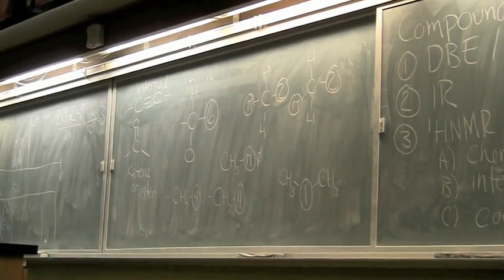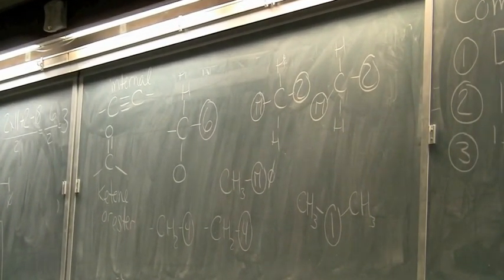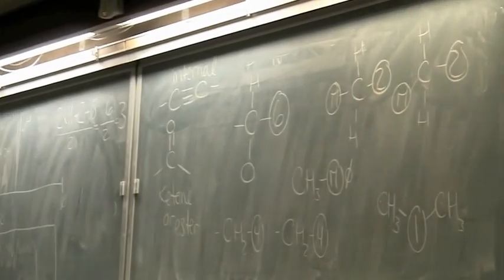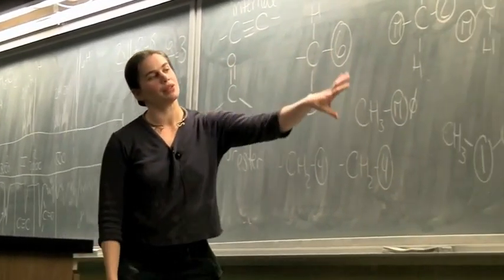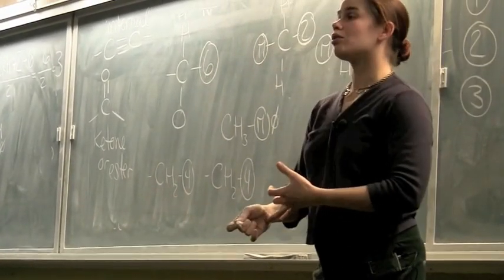Good. If you did have the wrong number of hydrogens, you did the proton wrong. If you have the wrong number of carbons and oxygens and double bond equivalents, you may have missed something in the IR. If you just have the wrong number of carbons, you may have a quaternary carbon you just can't see somewhere. If you have the wrong number of double bonds, that's when you say, well, I have a ring. Right now, we've got absolutely everything we're supposed to have. No rings, no missing double bond equivalents, got all the right atoms.